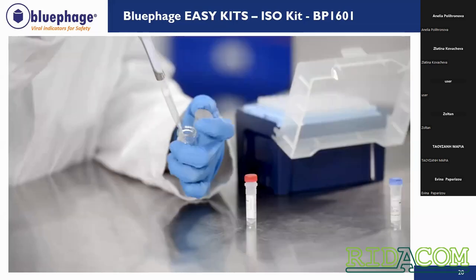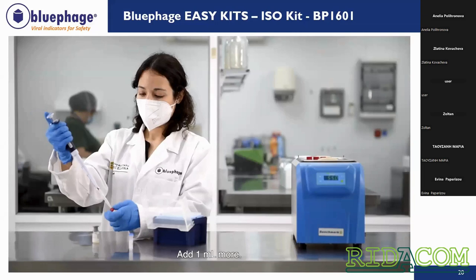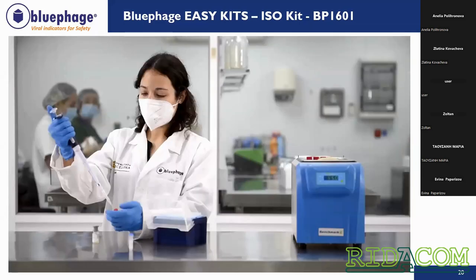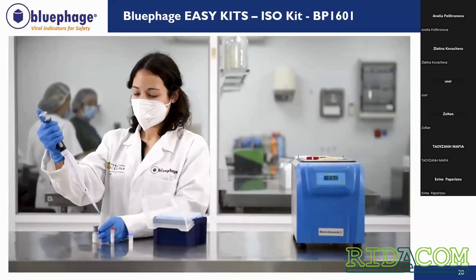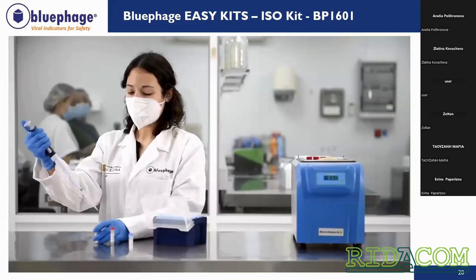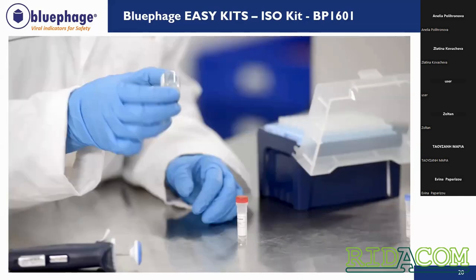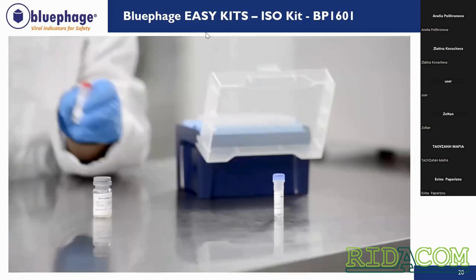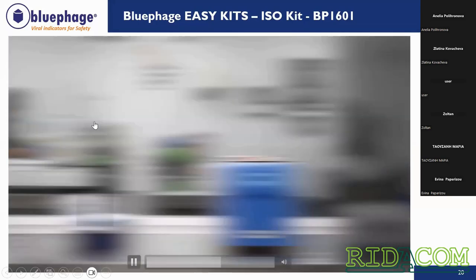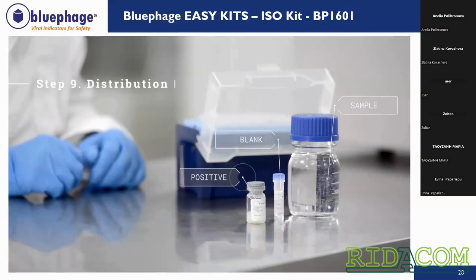We will mix, and we will add another milliliter more. And we will mix again. And this positive control must be used on the same day as well. So we will allow 10 minutes for the resuspension. And after these 10 minutes, we can add our samples in our test tubes.